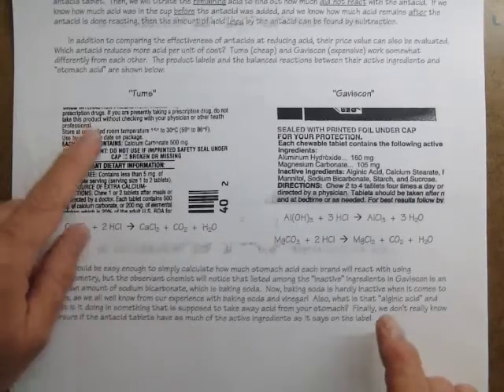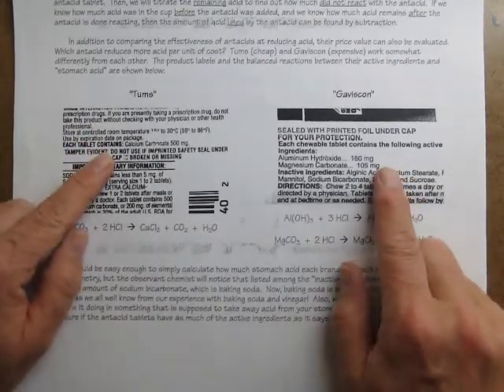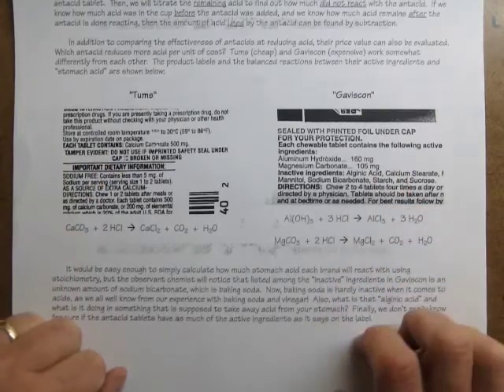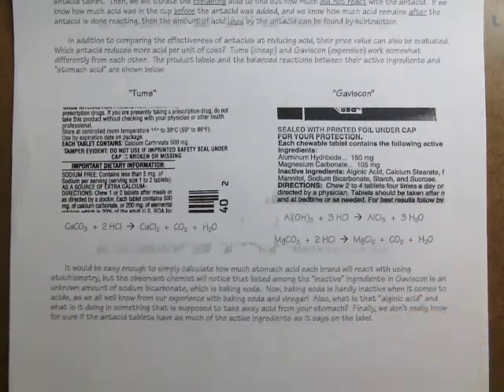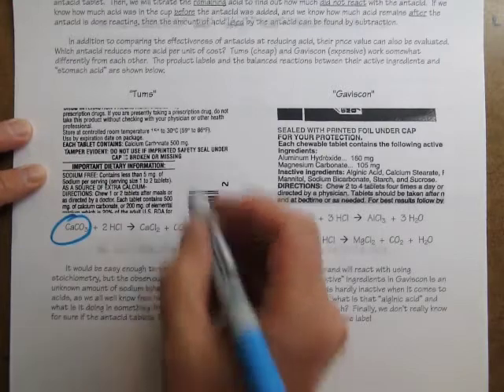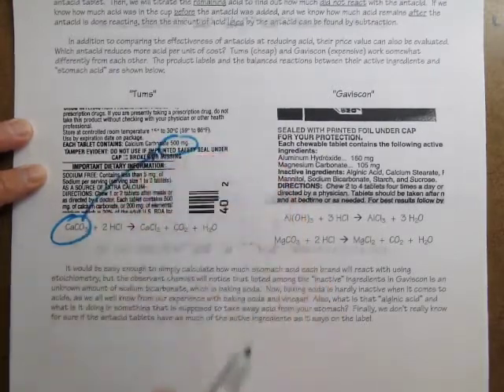Now just to review, what we're trying to do is find out which of these two different antacids, Tums or Gaviscon, is better. Both of them do the same thing. They react with hydrochloric acid in your stomach, but they use different active ingredients to do it. The Tums has one active ingredient, calcium carbonate. It has 1/2 gram.